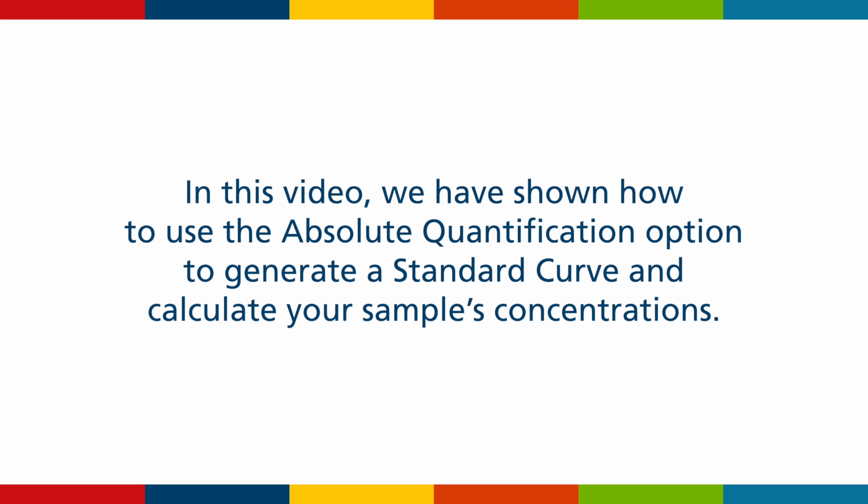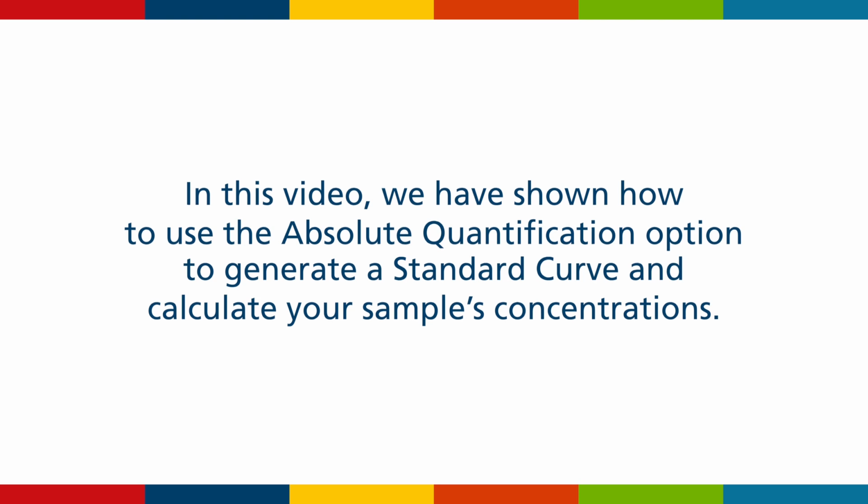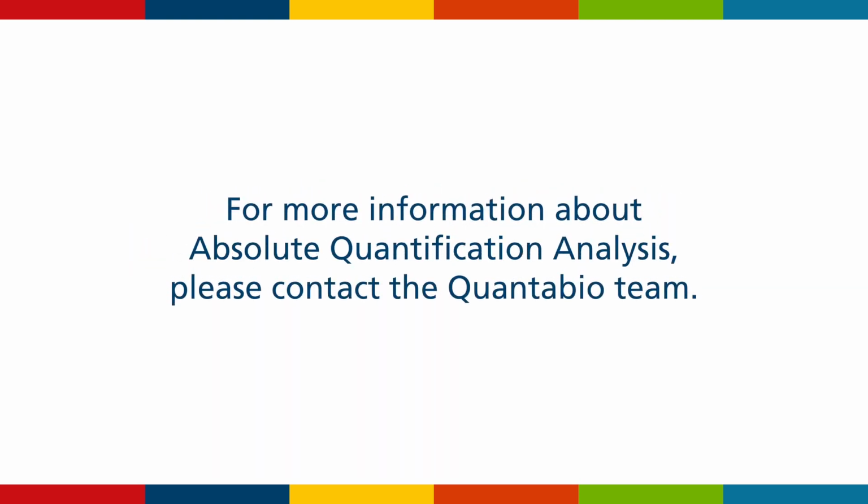In this video, we have shown you how to use the absolute quantification option to generate a standard curve and calculate your sample's concentrations. For more information about absolute quantification analysis, please contact the Quanta Bio team.